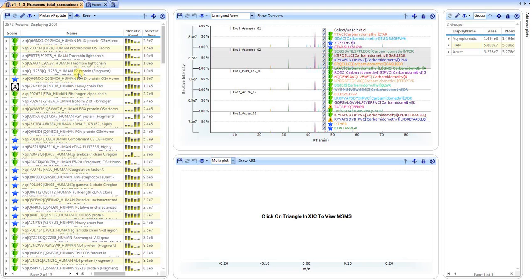And it's a complex system, so you can see that we've processed across 5 raw files about 2,500 proteins and there's about 10,000 peptides. And so processing these 5 raw files from a QExactive took about 15 minutes.